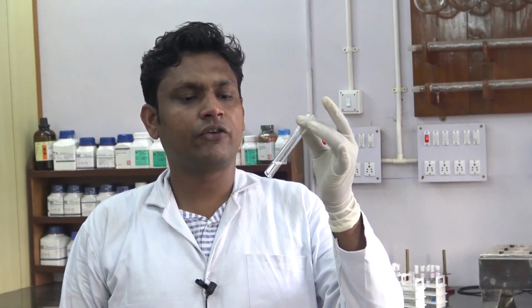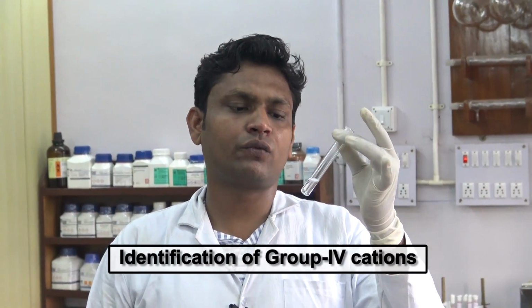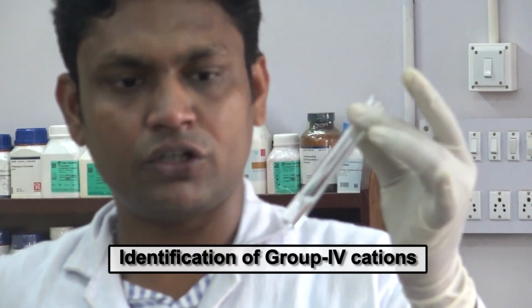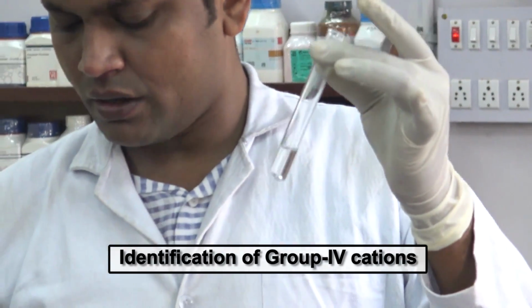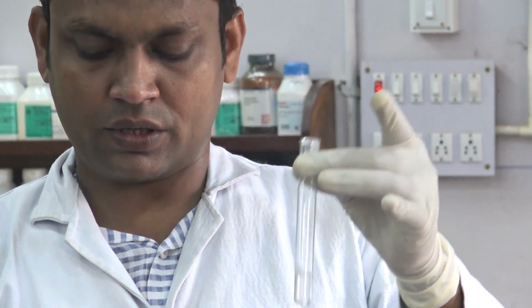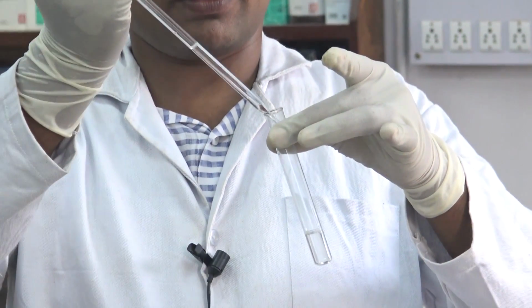Now we will treat the test solution with group 4 reagent. For this we have to take the test solution, add a pinch of ammonium chloride, then add a few drops of ammonium hydroxide. Here you can see no precipitation has occurred.